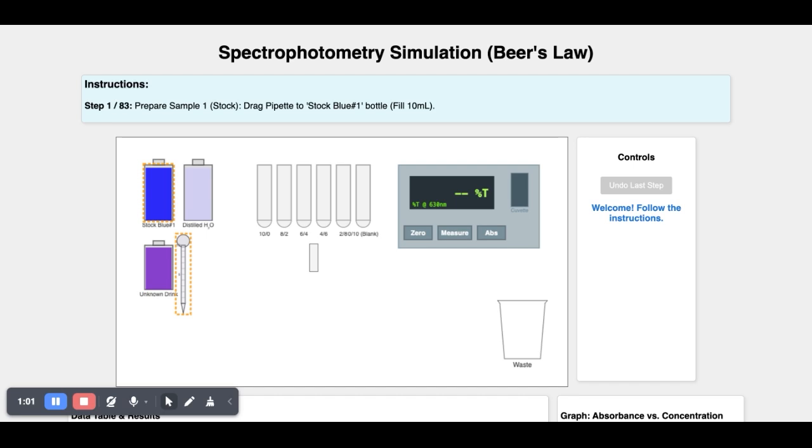The linear graph showed that absorbance increases directly with concentration, meaning the dye behaves in a predictable way when absorbing light. After establishing this pattern with the known solutions, the same measurement method was applied to an unknown sample. Because the unknown's absorbance fell along the same line, its concentration could be calculated using the slope from the calibration curve. This experiment demonstrates that spectrophotometry is a dependable method for determining the concentration of substances in solution and shows how light absorption relates to chemical analysis.